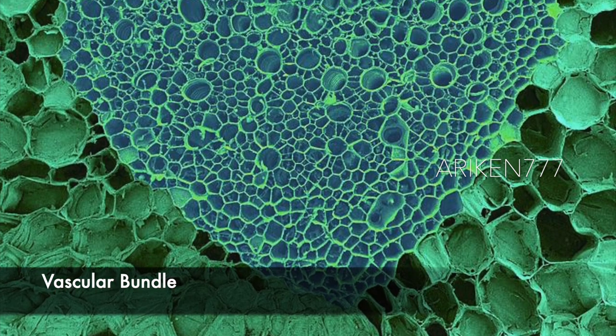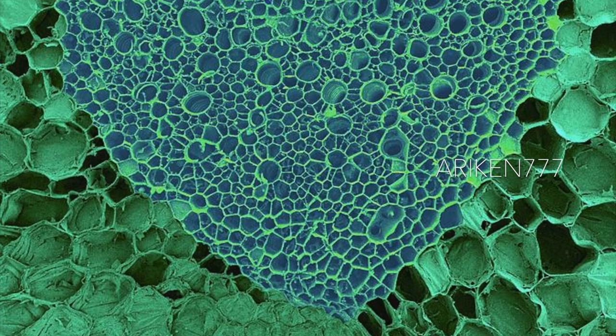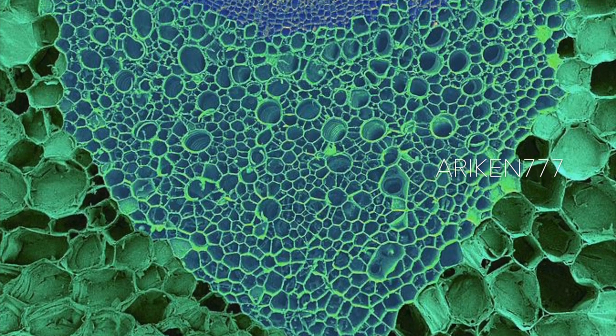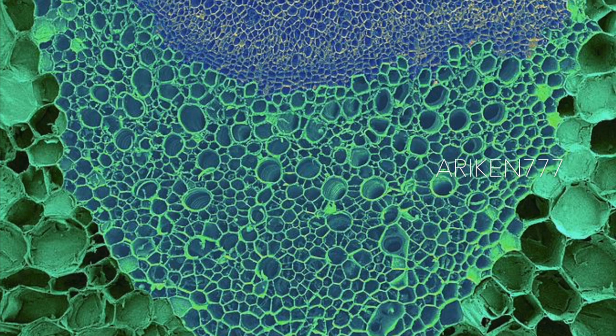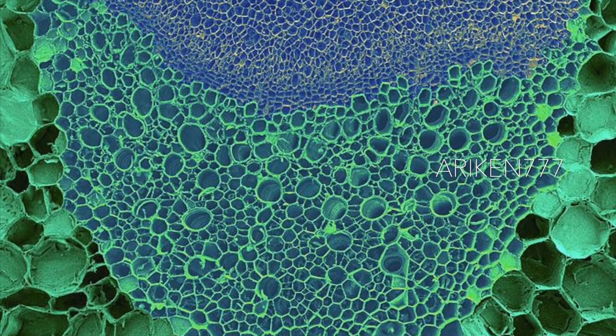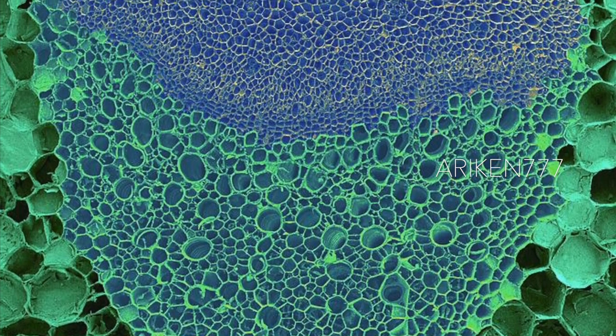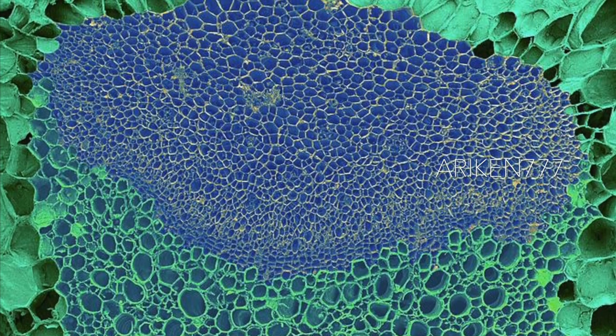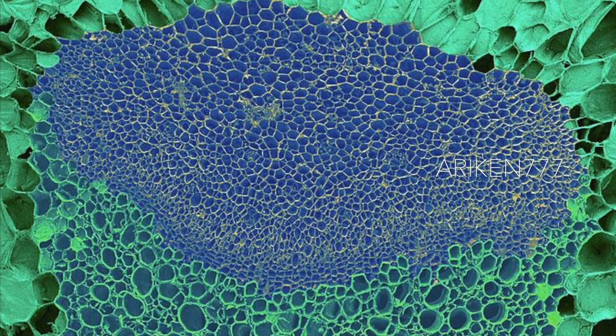Celery stalks have numerous vascular bundles which act as a transport system. Shown here is a single vascular bundle in a celery stalk. The vascular bundle contains two types of conductive tissue: phloem and xylem. Phloem, seen here in the top area, is tissue that transports larger organic molecules through the plant and is composed of several cell types. Xylem is tissue responsible for transporting water and nutrients through the plant, and consists of a variety of specialized water-conducting cells known as tracheary elements. Surrounding the vascular bundle are supporting plant collenchyma cells.